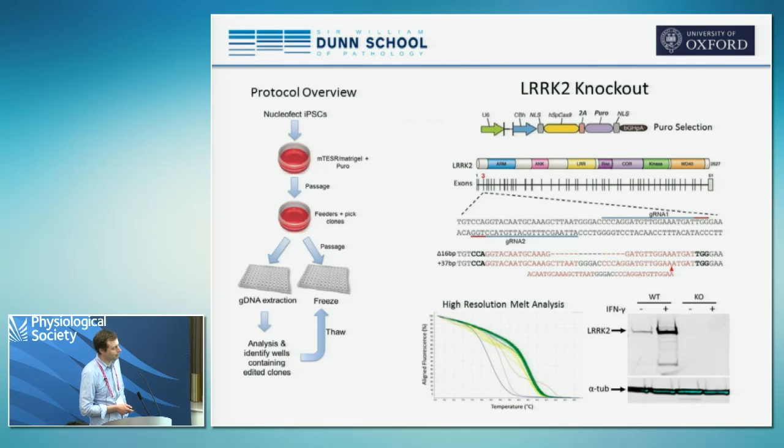Looking down here, we see a Western blot. I should mention LRRK2 is upregulated by interferon. That's one of the few things we know about it. And we can see in the knockout there's no sign of a full-length protein, is what I should really say.